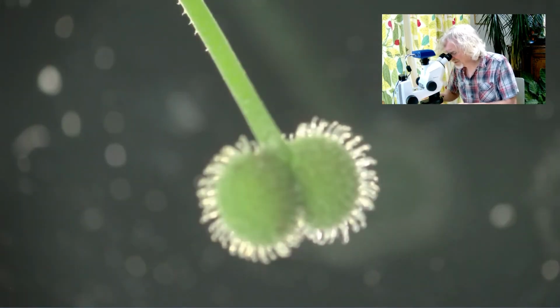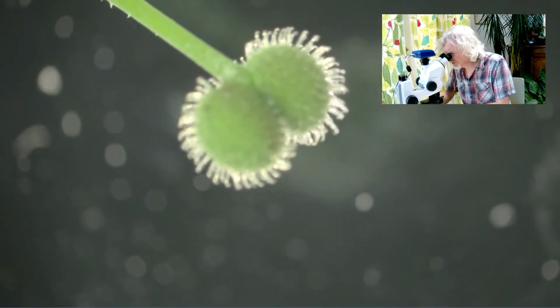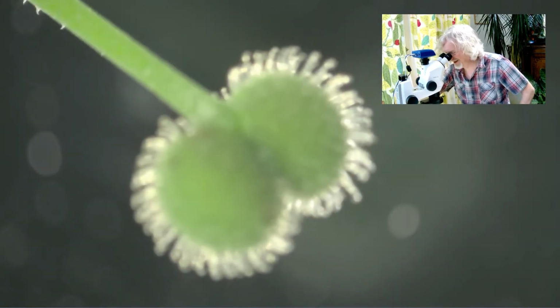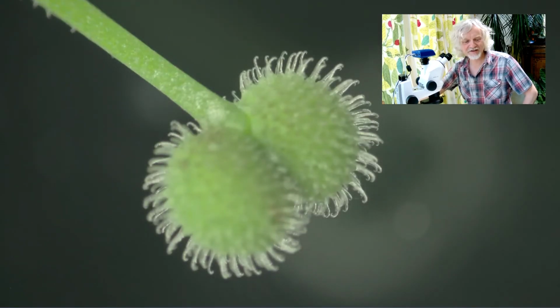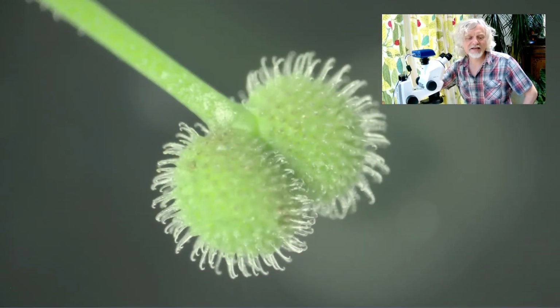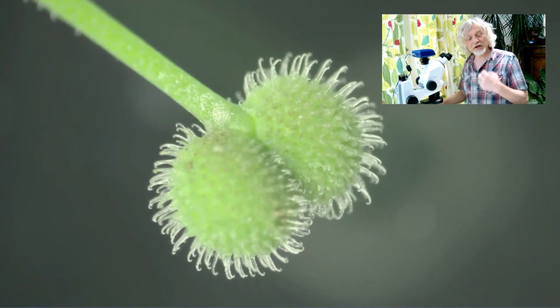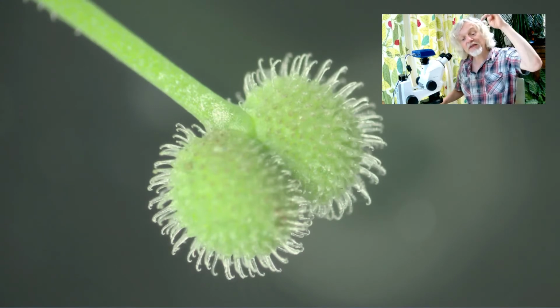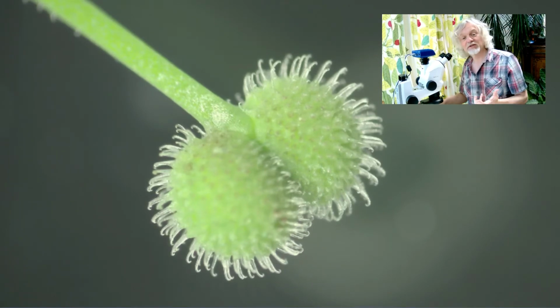You end up with these things forming. And I'm having to position this quite carefully, because these things, look at these. Isn't that beautiful? If I turn off the backlight, you can sort of see it quite nicely. So these are the burrs. These are the seeds that form, and they are also covered in tiny, tiny little hooks. These are the same hooks that are on the surface of the leaf. They're not the same hooks that are on the stem itself. So you've got 2 different types of hooks.